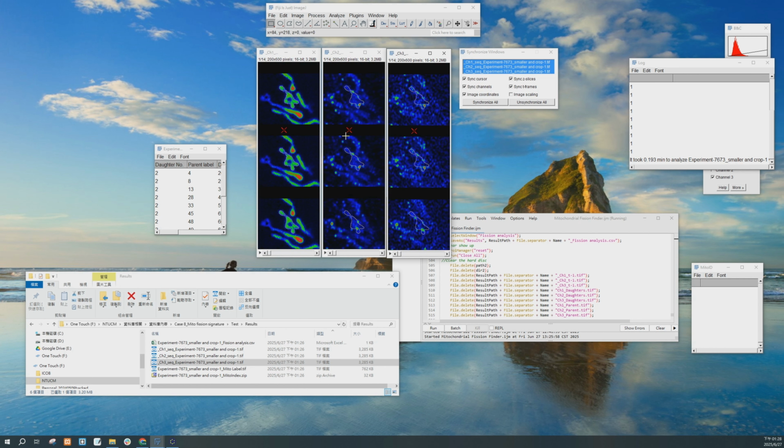So, for this one, we can see that, because channel 2 is DRP1, we already know that DRP1 forms a structure that constricts and pinches off the mitochondria. As you can see here, at this location, where mitochondrial fission is about to take place, DRP1 really just happens to be right at this position. That would be at their junction. Meanwhile, at the T plus 1 time, you can observe 2 additional mitochondria distributed at this position, which seems likely to be the site of upcoming division.